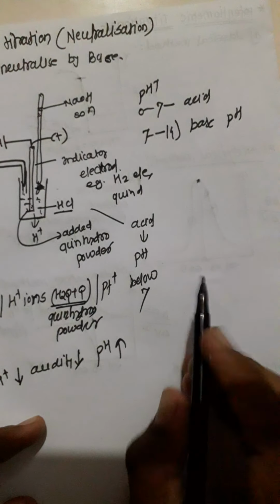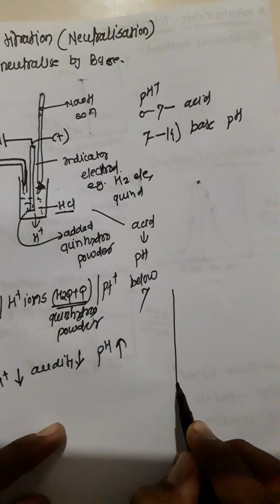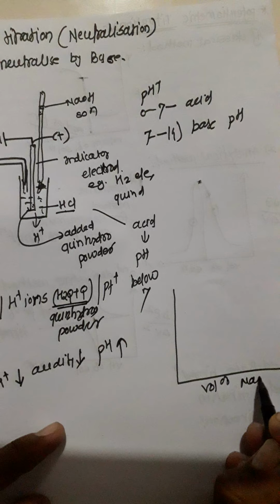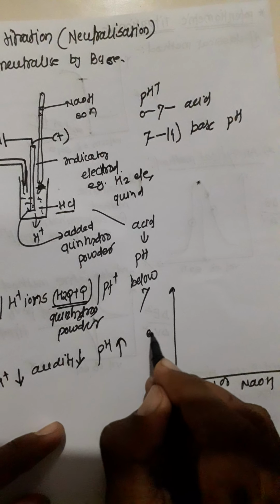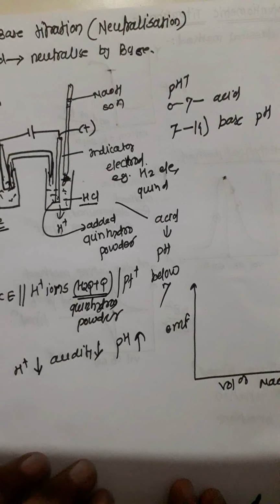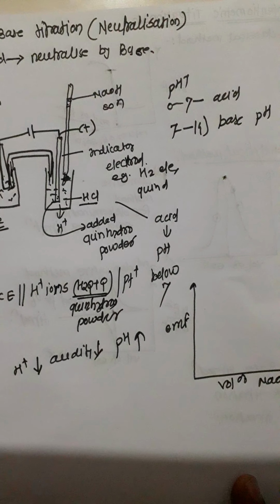In graphical representation, this is the volume of base, and here is the EMF.